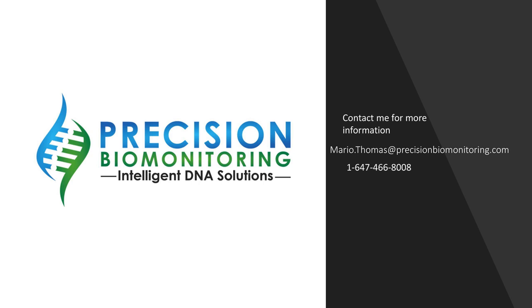So you raise a good point. The normalization is a crucial step, and the most tricky part of normalization is dealing with the zeros in your sequences. For example, you have a species in a sample that is not represented by any sequence, so you will get a zero count, and the whole process of bioinformatics doesn't really like zeros. So you have to choose a good normalization process, and the latest and best normalization, in my view, is the centered log-ratio normalization. There are lots of papers and tools that can help you with those kinds of normalizations. Thank you, Rémi, for answering Soren's question.